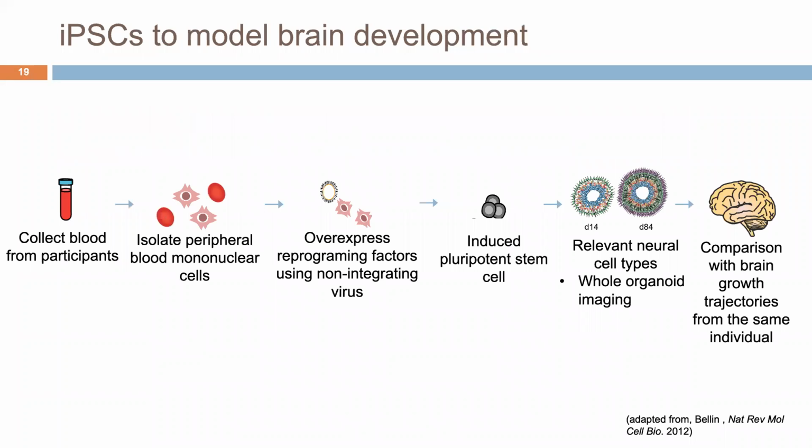Okay, so switching gears a bit, I'm going to talk to you about applying some of these tissue clearing techniques to a different model system of the brain. In this case, human brain organoids, which are 3D cultures of brain cells that mimic some of the structure of the developing cortex. So human cortical organoids can be derived from individuals who are deeply phenotyped. And in this case, we are making cortical organoids from individuals of the Infant Brain Imaging Study, or IBIS, who have had MRI scans and behavioral measurements longitudinally since infancy. It's a very cool and detailed cohort.